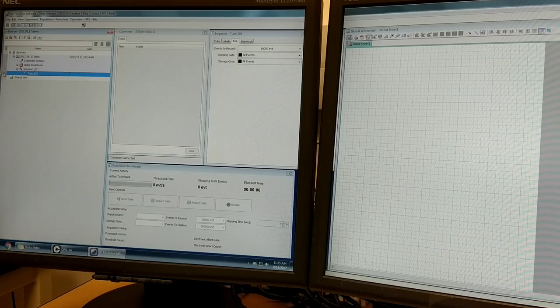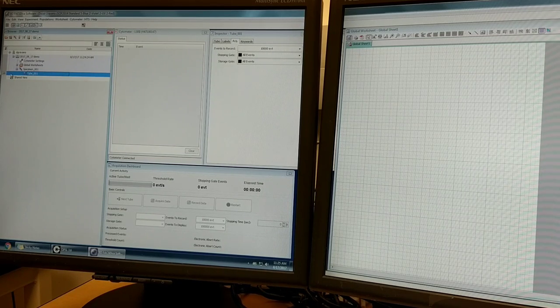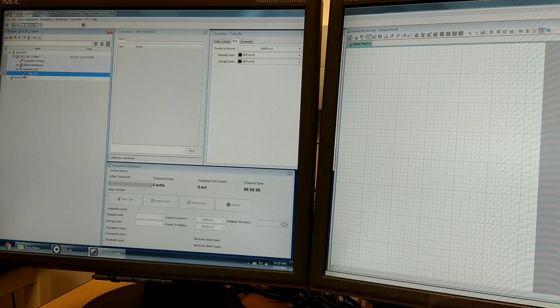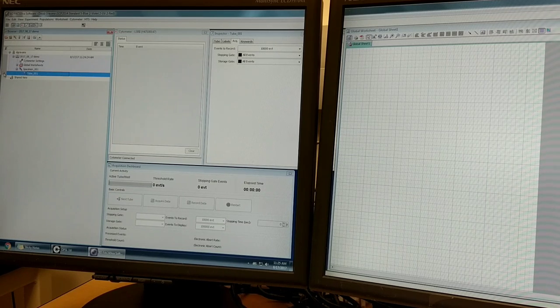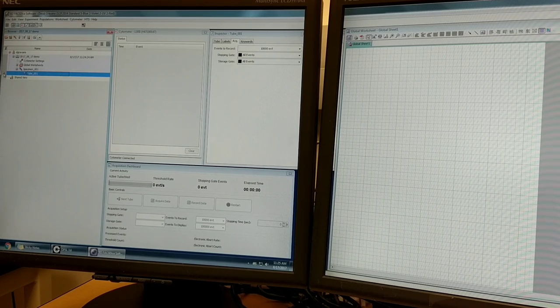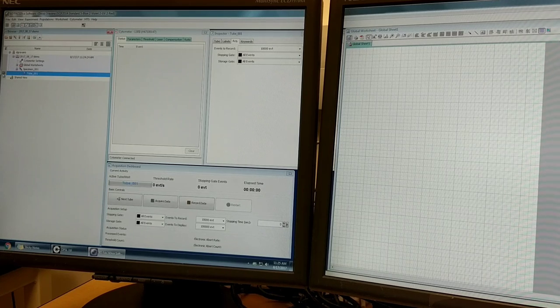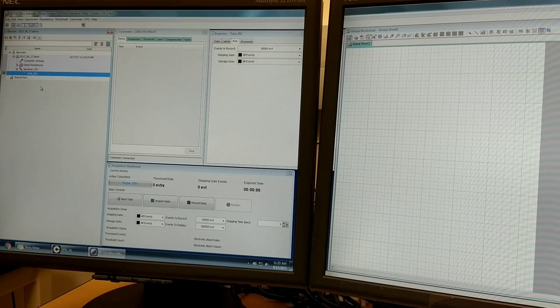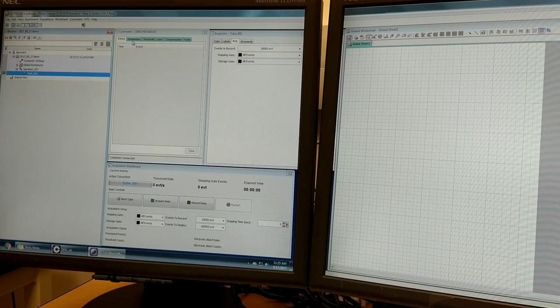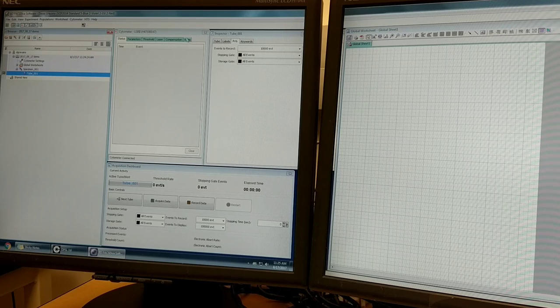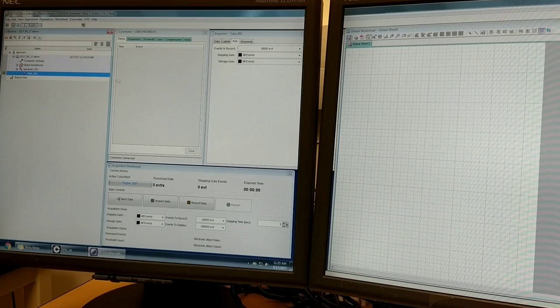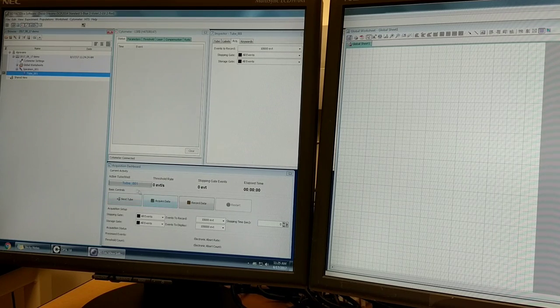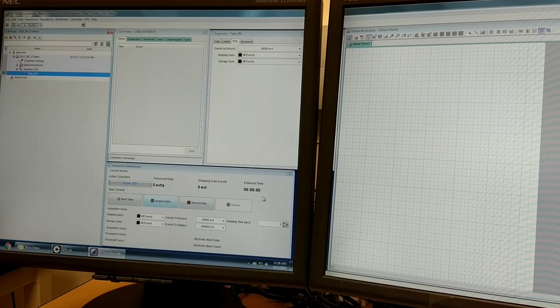Let's start by clicking on the tube. The button to the left of the tube is really important - this is what's going to actually activate that tube. If you click it, it will turn green. Now a bunch of tabs have appeared in the cytometer window, and you can see in the acquisition dashboard you can now start acquiring the sample.